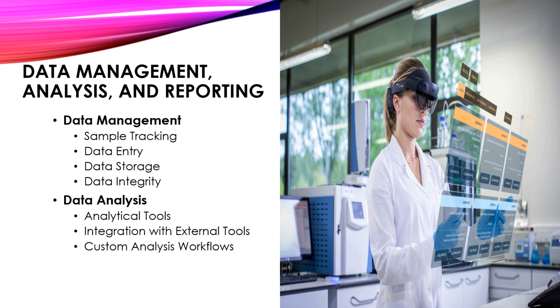Laboratory management systems help in tracking samples throughout the testing process from collection to analysis and storage. Each sample is assigned a unique identifier to ensure traceability. Data entry. Laboratory management systems allow for the entry of various types of data, including sample information, test results, experimental parameters, and more. And this data can be entered manually or through automated interfaces with laboratory equipment or instruments.